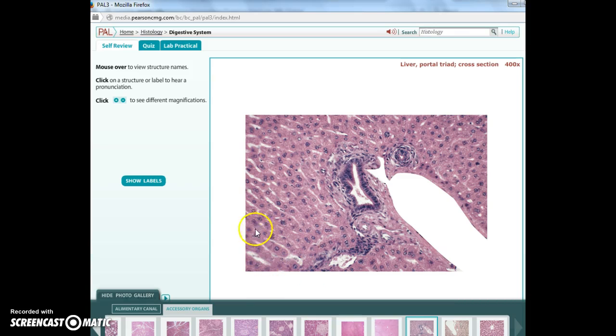Okay, in this picture, here are the hepatocytes again. The little white channels are going to be the sinusoids, and from this one, they would be going in kind of away from this area. This is our triad. And so I have 3 things. I have a bile duct. And you can note they should be simple cuboidal cells.